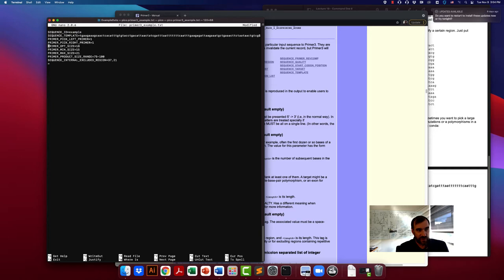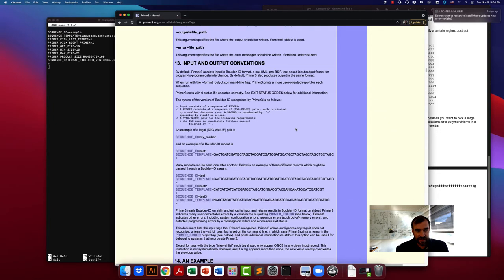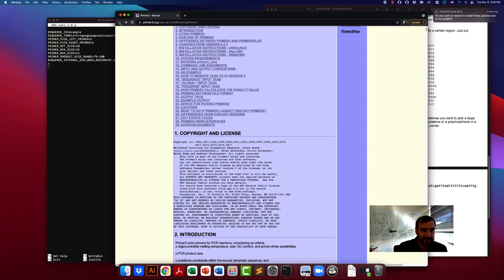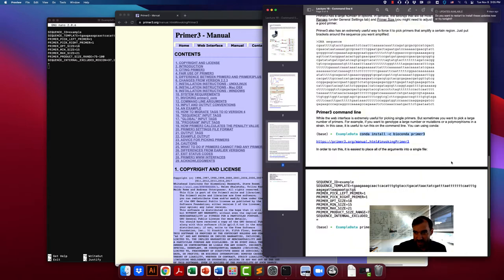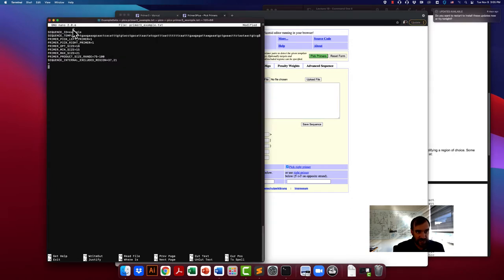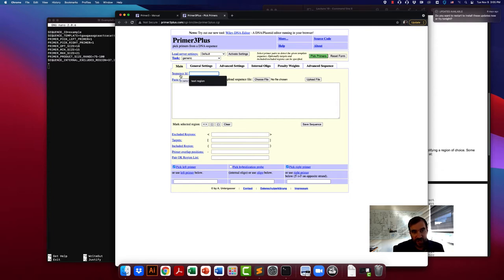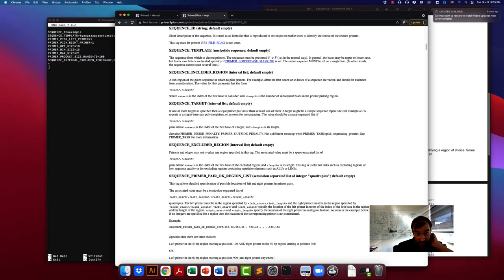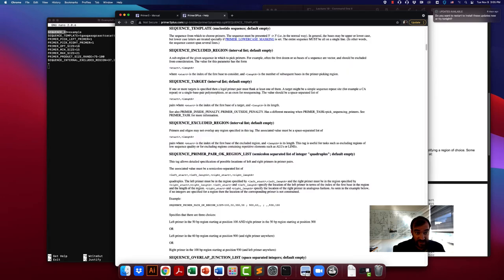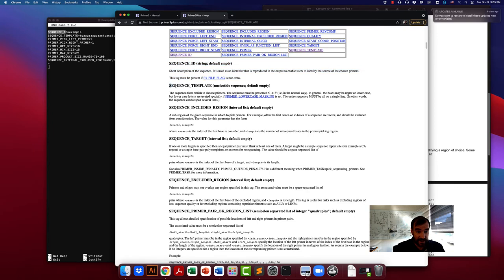You're actually able to give it multiple sequences to pick primers from, and each one would be separated by an equal sign. If you go to their example, you'll see something like that where they have a bunch of different sequences with different names and sequences, all with an equal sign to indicate the end. That is the basics. When we looked in the web browser, you can provide it with a sequence ID and a template sequence — this option here is a one-to-one correspondence with the command line option. You just need to know the name of that argument, like SEQUENCE_ID.